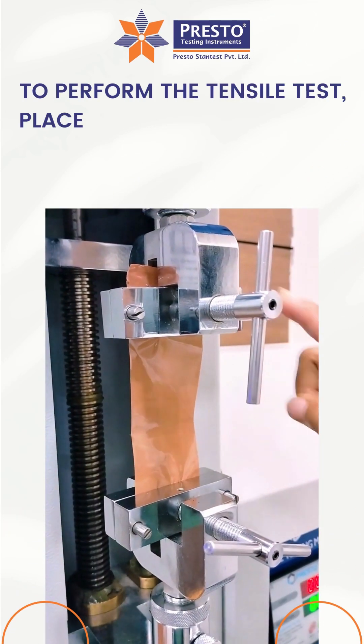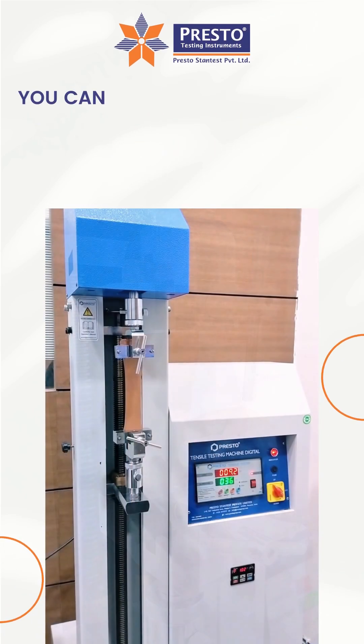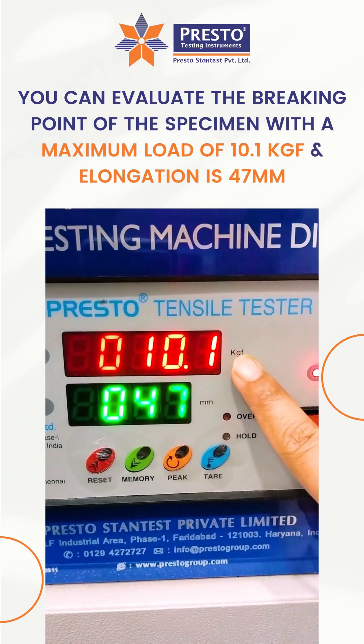To perform the tensile test, place the specimen between the lower and upper grips and start the test. You can evaluate the breaking point of the specimen with a maximum load of 10.1 kgf and elongation of 47 mm.